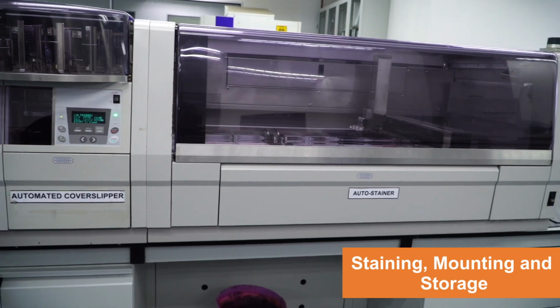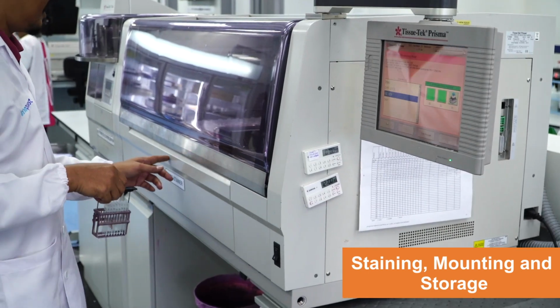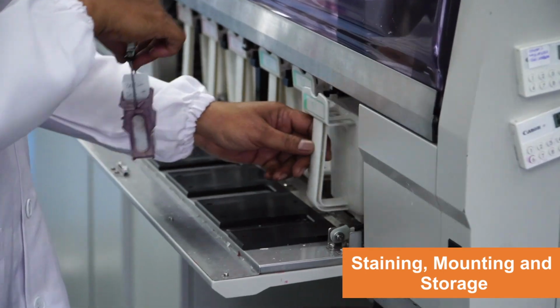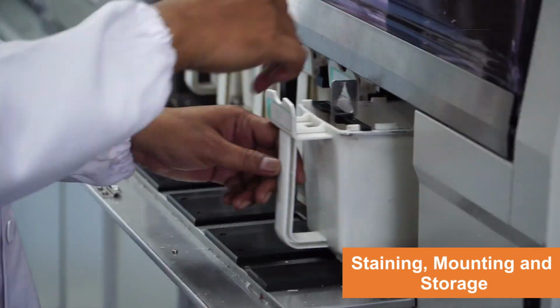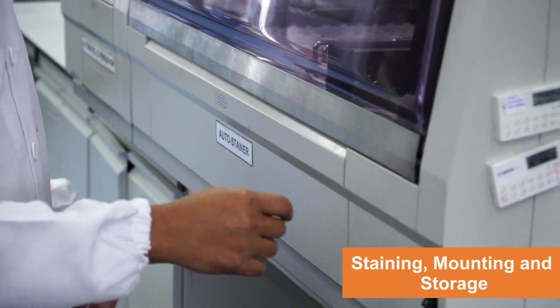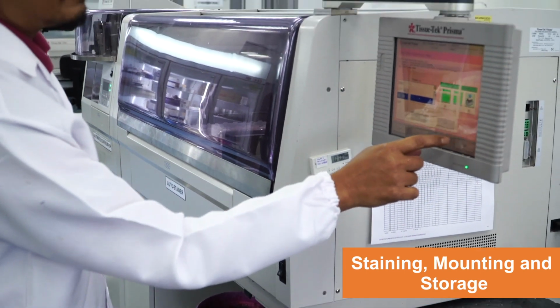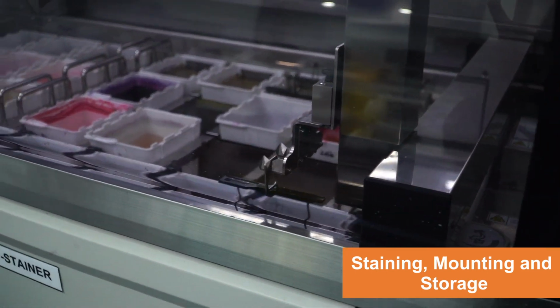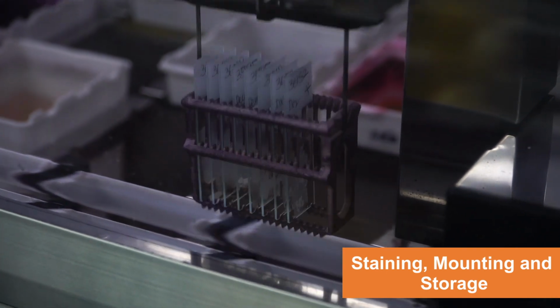After slicing tissue sections, observing them under a microscope poses challenges due to their colorlessness. Staining is crucial to enhance contrast and reveal tissue structures. Automatic staining machines in hospitals ensure consistent and standardized procedures, reducing variability between technicians.